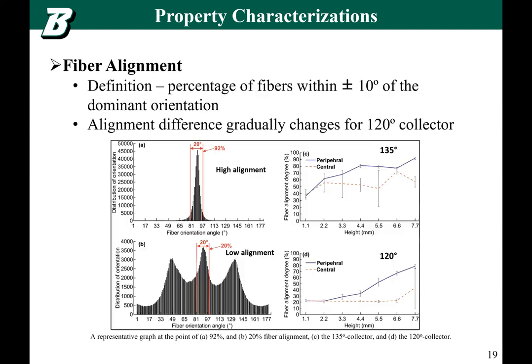So what about the fiber alignment? First we need to define how to measure the fiber alignment.